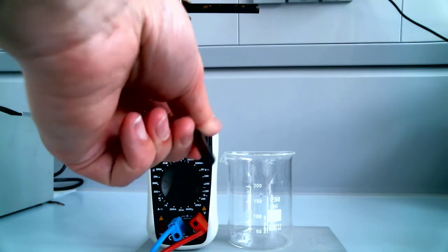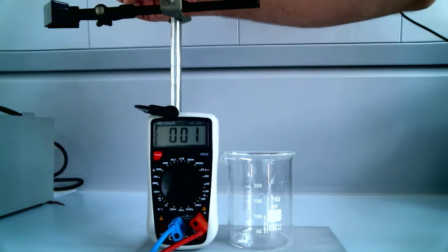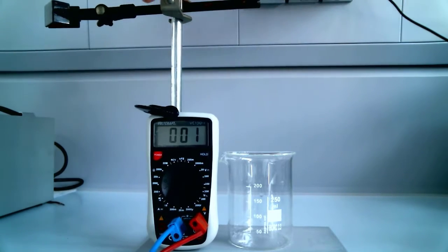I just showed you the case of it. Here it is, the carbon electrode. Just the end is exposed to the solution. We're going to put the carbon electrode into the solution and measure its voltage compared to a reference electrode.